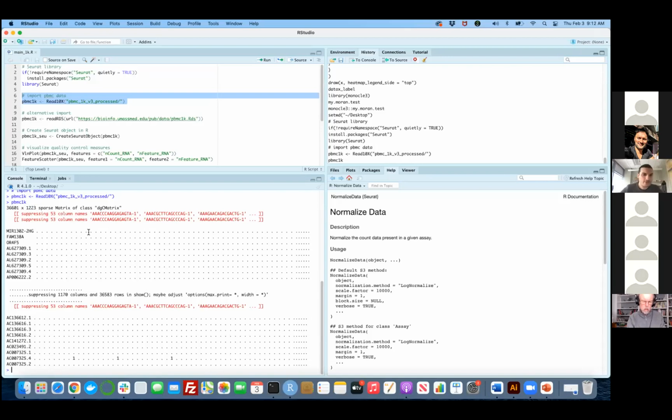So as you can see, there are some dots over here. Dots meaning there are just zero. This is normal for single cell because most of the genes wouldn't have any expression in any particular cell. But I mean, there are thousands of numbers over here. Even though we don't see them, they actually have substantial amount of UMIs. So in order to take a look at the UMI distribution and the number of counts, we have different kind of methods, and that's what we are going to do today.